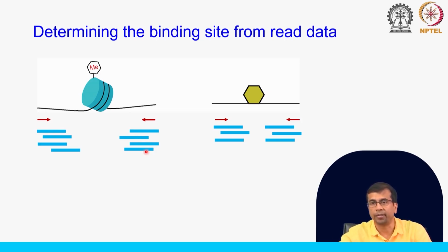What's the major challenge here, and what kind of output will we get, and what kind of analysis will we have to do? Here we have a bunch of reads. These reads are simply DNA fragments that are generated by sequencers. The most common sequencer, like Illumina, gives us short read fragments, with sizes between 100 to 250 base pairs at most. So, these are the reads here.